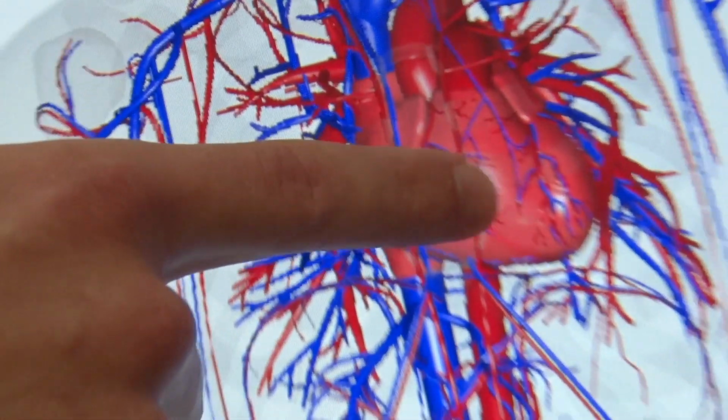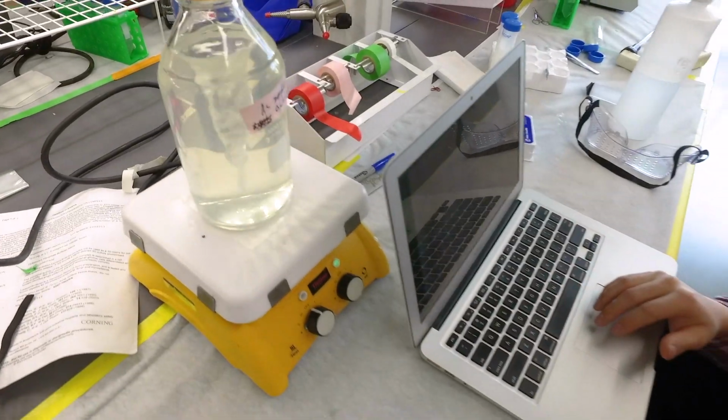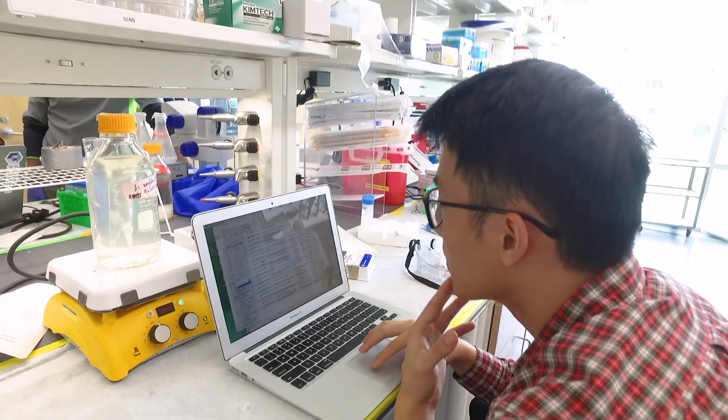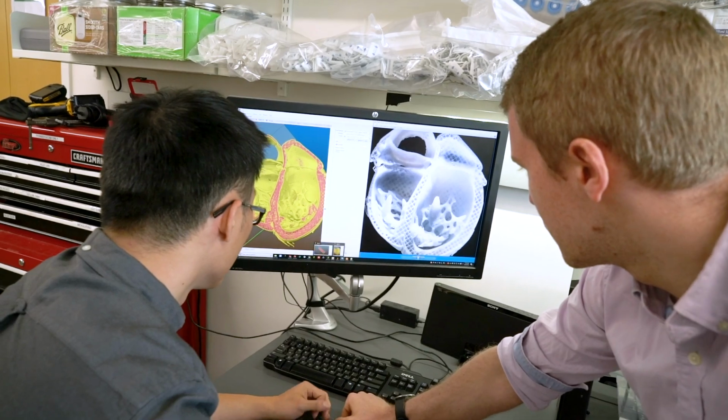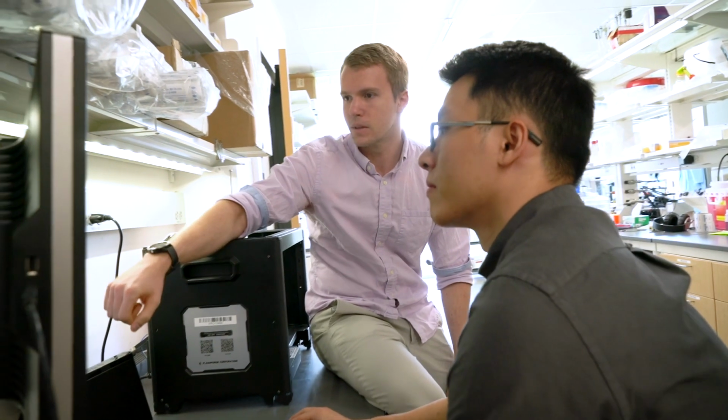So there are still a lot of challenges that exist for us to actually create a fully cellularized human heart. This includes generating enough cells, which is very expensive and time-consuming, to actually generating the contractile function that's found in the human heart. This platform technology actually allows us to start investigating the complexity and also allows us to start fabricating these tissues that are complex in their material composition as well as their architecture. And this allows us to create three-dimensional organ functions that more closely mimic what is typically found in the human body.